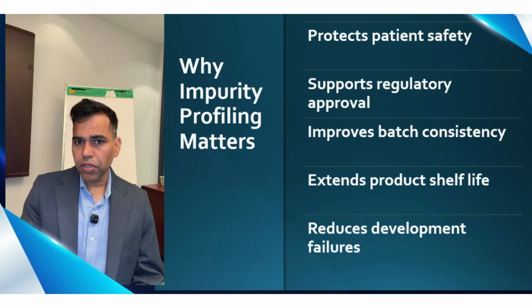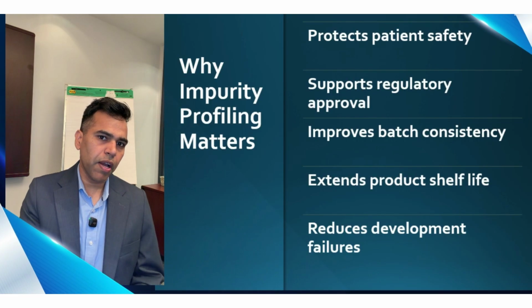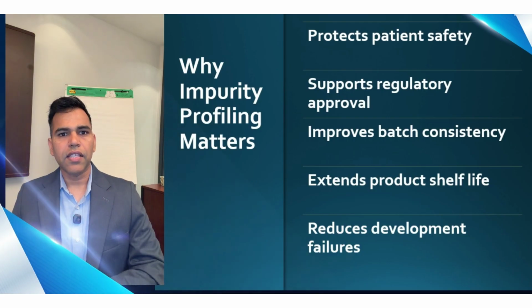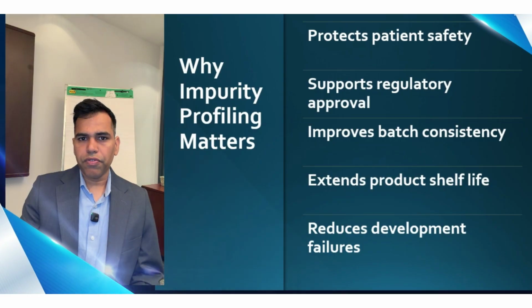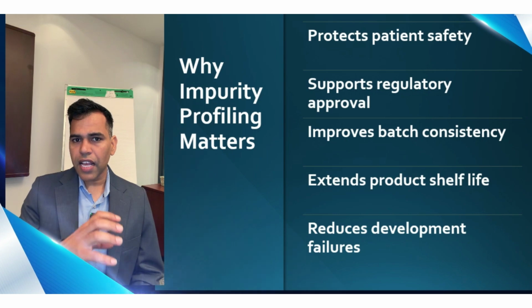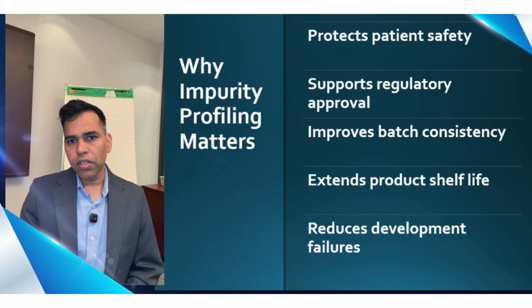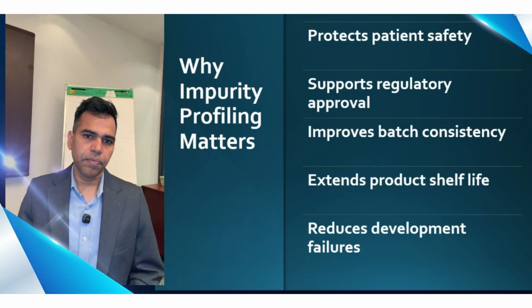Peptide-Oligonucleotide Conjugates (POCs) occupy a growing corner of the therapeutic pipeline. They combine the target specificity of oligonucleotides with the cellular access that peptide provides. That combination is powerful. It is also analytically difficult in ways that catch experienced development teams off guard, because the molecule your method sees and the molecule you actually made can be two different things entirely.